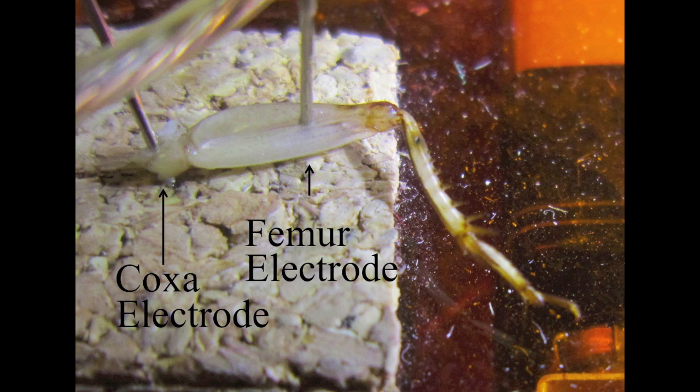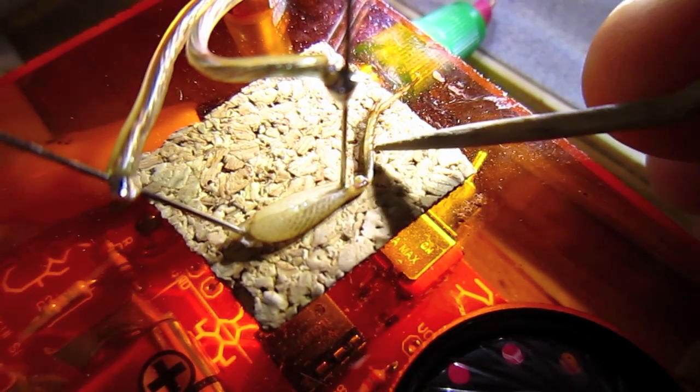Let's put one electrode in the femur and one in the coxa. There's not much of a response when I touch the barbs on the leg, but what if I lightly breathe on the leg?